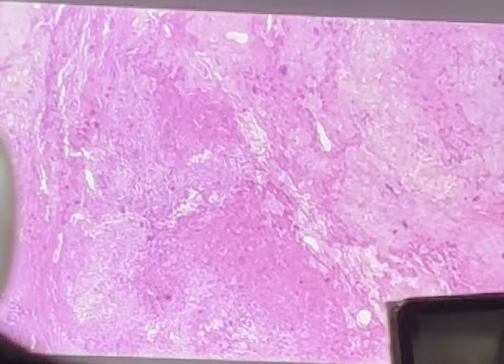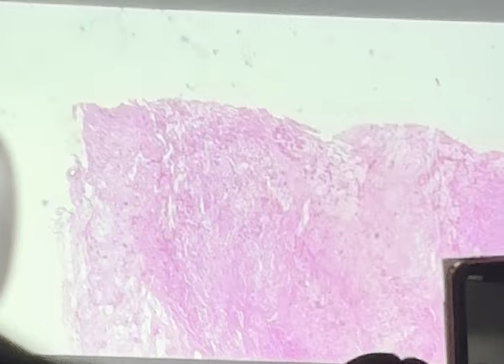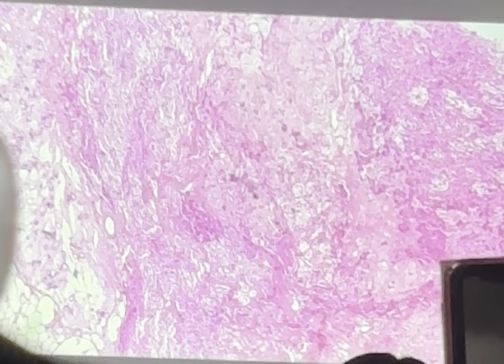Oh, there's another lipoma. So, I took 2 slides for that. That one was in a little bit better state. Oh yeah, I don't like this slide because the staining is really bad. But I will try to show it to you anyway.